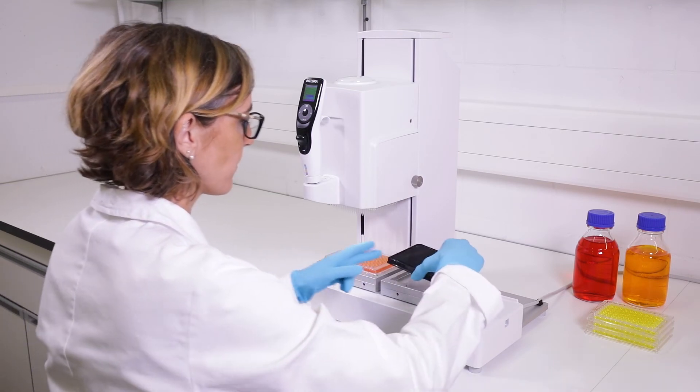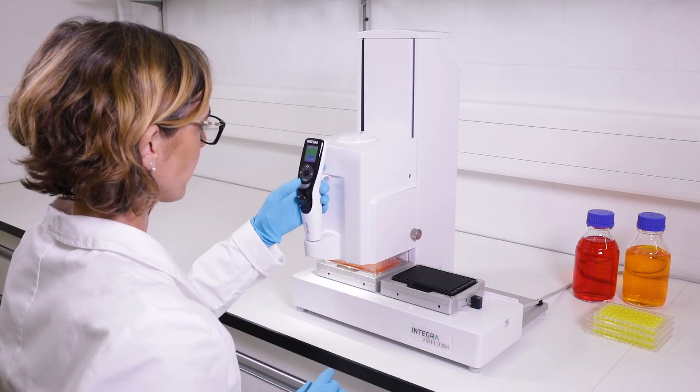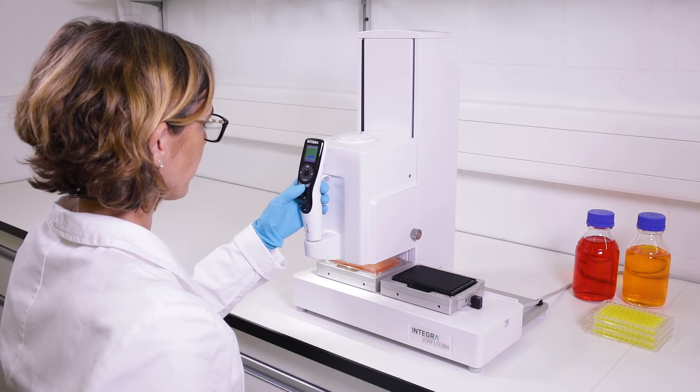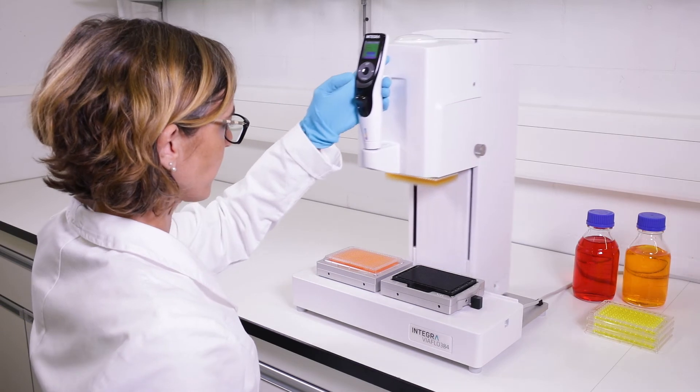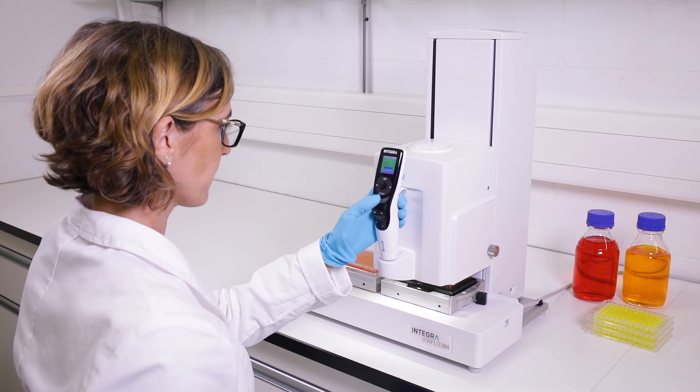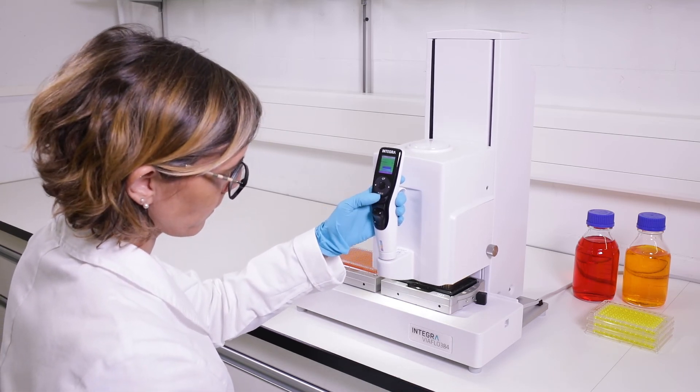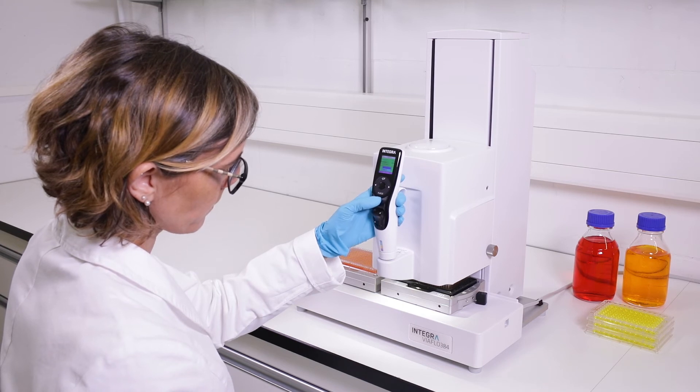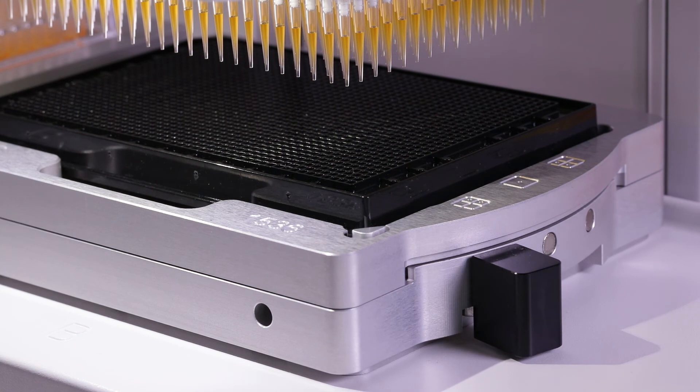ViaFlow 384 enables even 1536-well pipetting. This high precision pipetting task can be carried out by using an optional 1536-well plate holder. The procedure is the same as reformatting 96-well plates to 384 format. Simply shift the lever to access the wells in the front and the back.